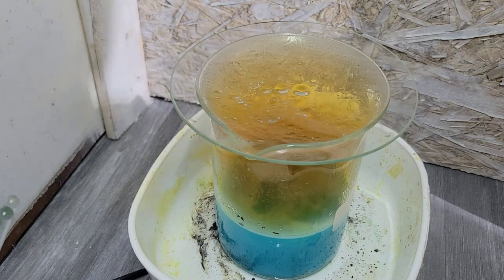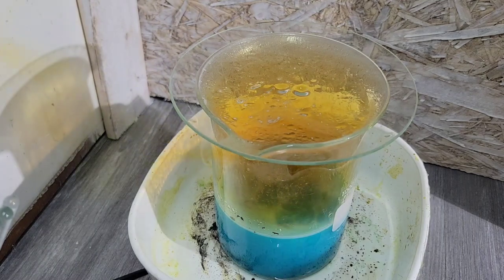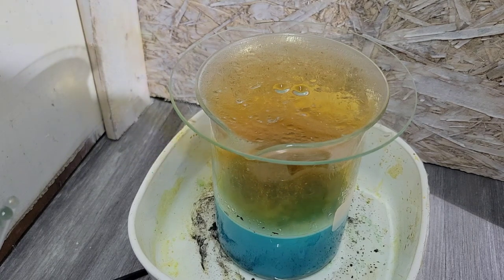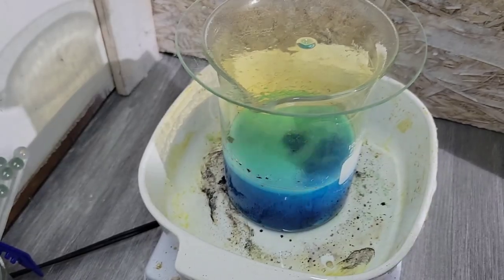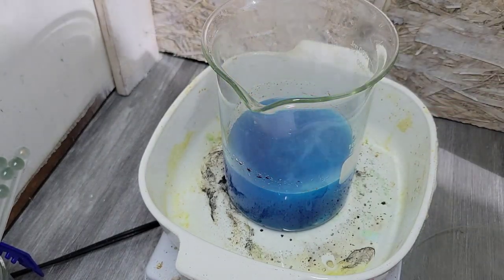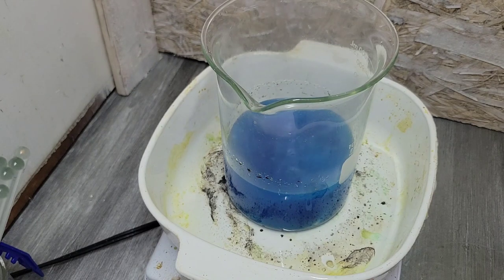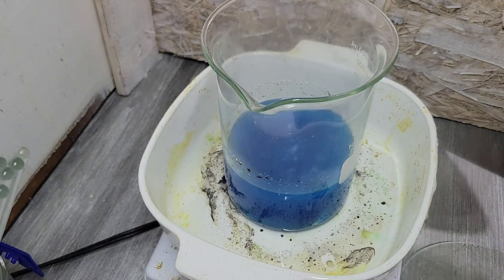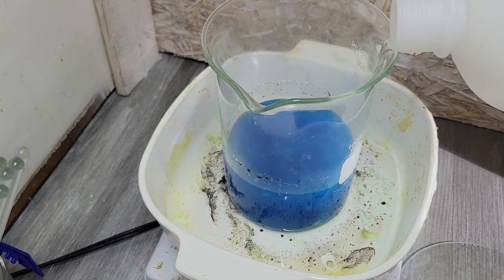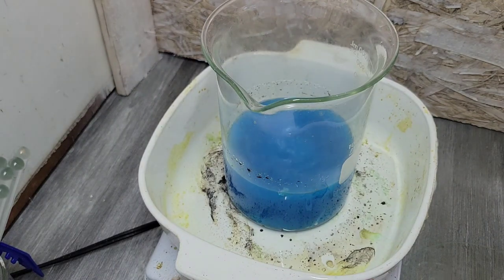194, 200 degrees. All right, I'm gonna let this sit. I'll come back when the reaction's done. All right, so the reaction slowed down. What I'm gonna do is add a little more nitric. I'm gonna do it very slowly. Make sure we don't get a boil over.